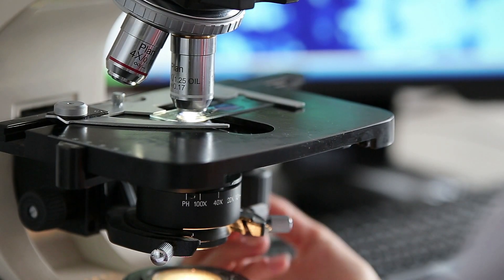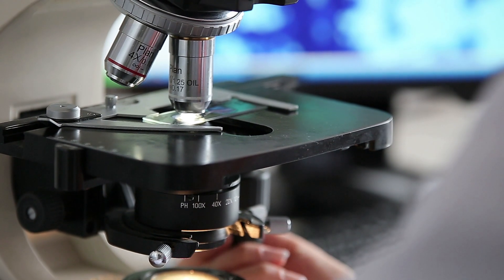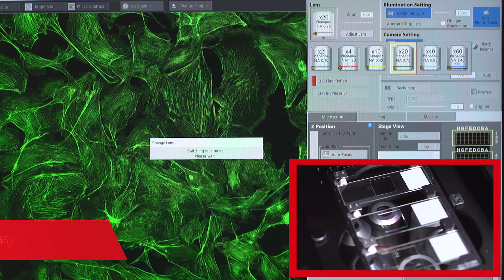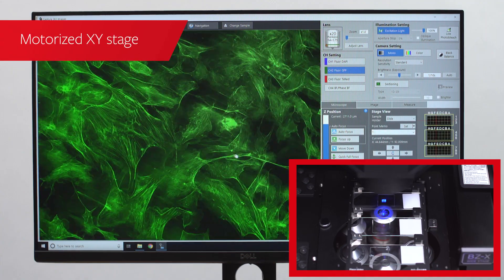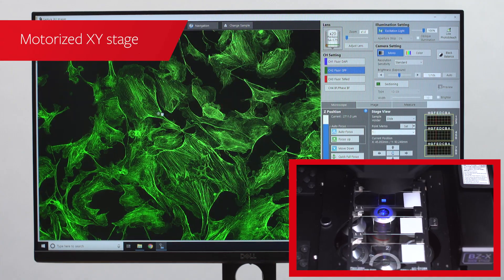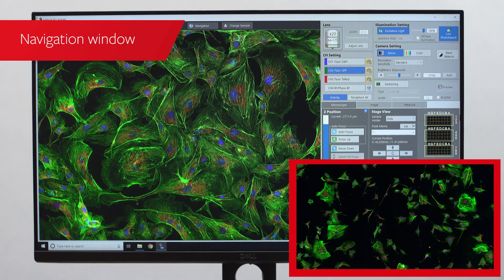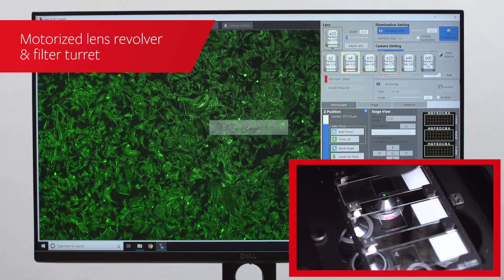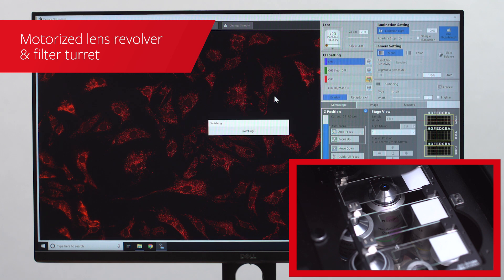Unlike conventional microscopes that require a user to manually adjust multiple settings and buttons or knobs, the BZ-X hardware is fully controlled with an easy-to-use software. A motorized XY stage allows users to easily move to the location of interest on their sample, while a navigation window gives an overall view of the specimen. Additionally, a motorized lens revolver and filter turret adjust magnification and fluorescence channels with the click of a button.